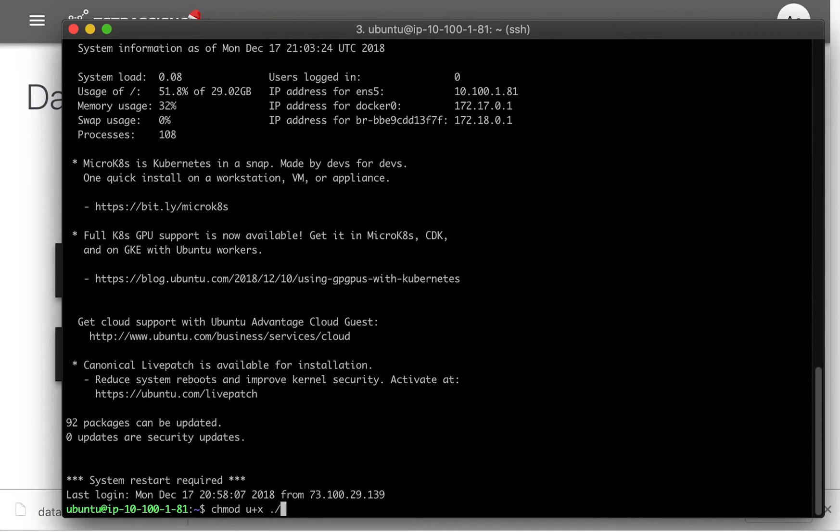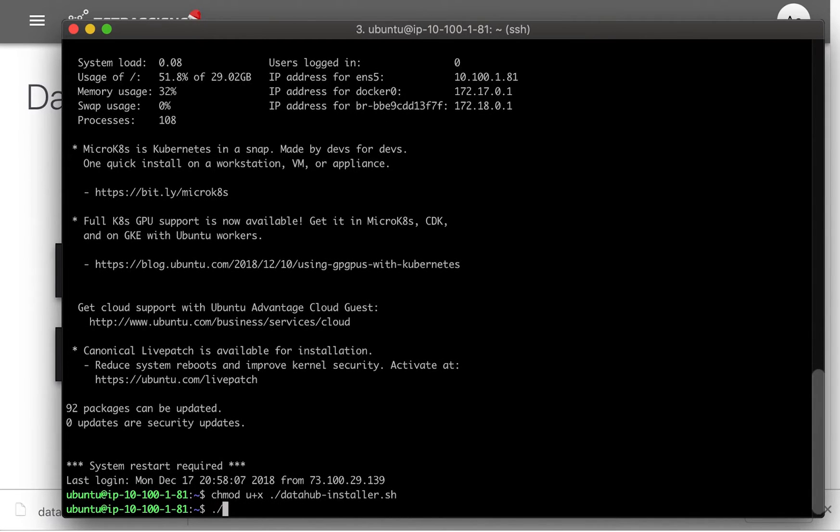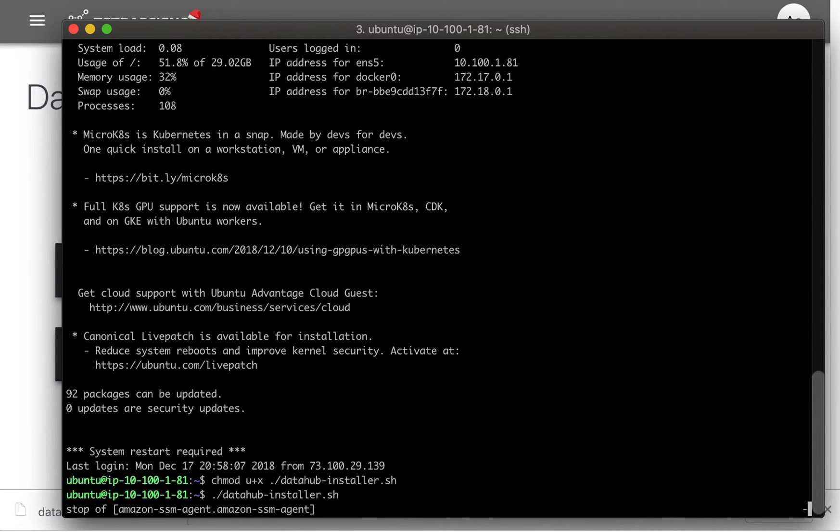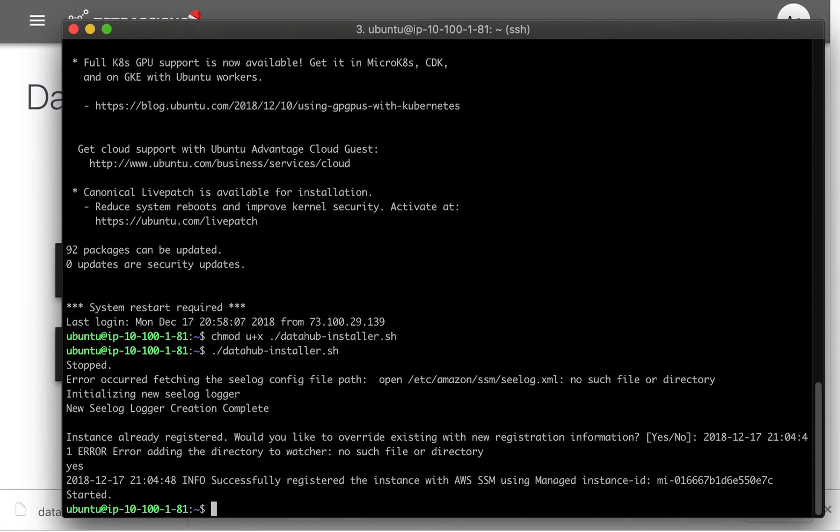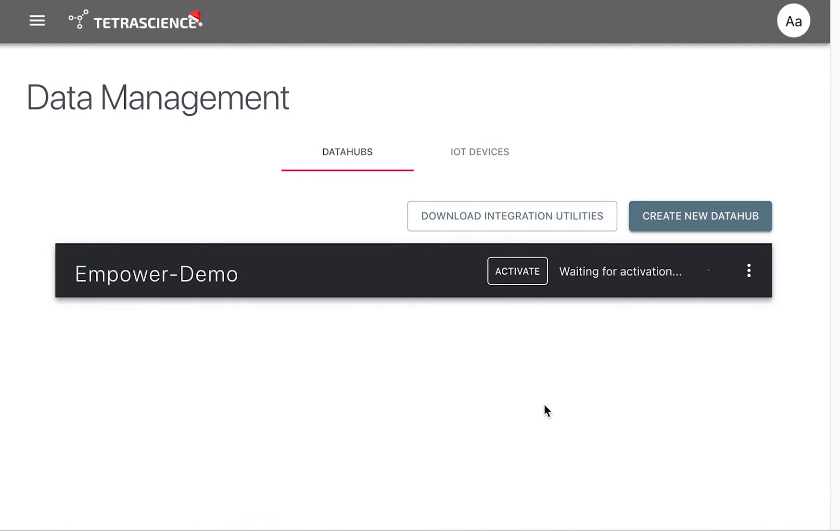Its main function is to register AWS System Manager on the Data Hub so that Empower data may be transferred to an AWS S3 bucket. Once the Data Hub is configured, we'll jump back to TetraScience and activate it.